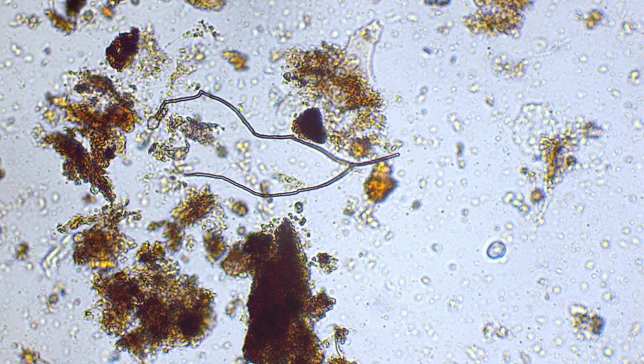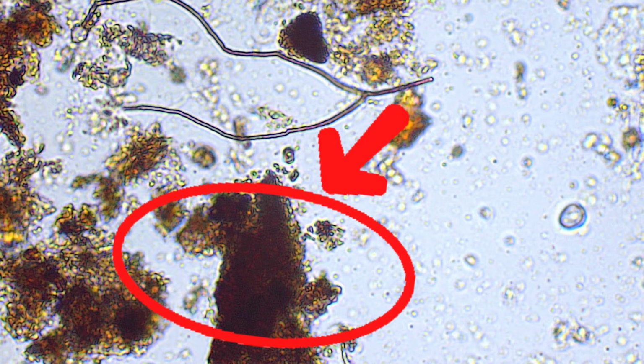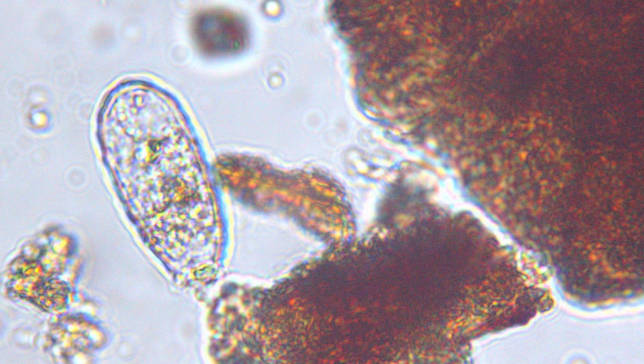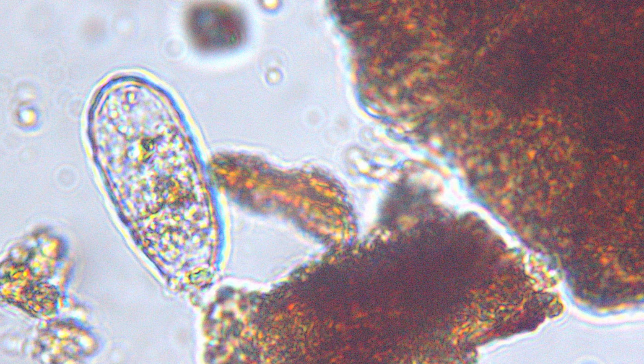Organic matter. You may also see chunky clusters that are darker brown in color. These are organic matter complexes where microbial secretions glue organic and mineral components together and offer a storehouse of nutrients, carbon, water, and microbial habitat.